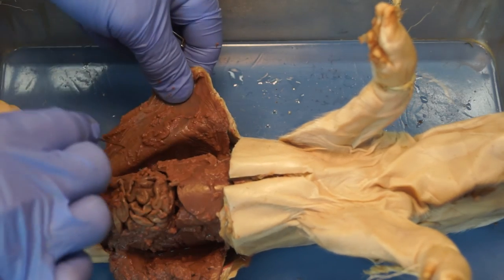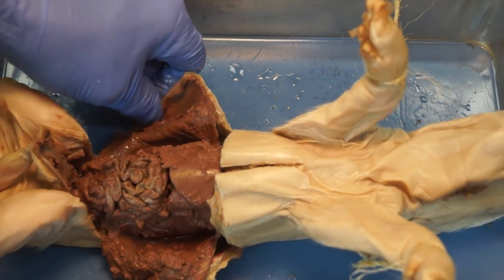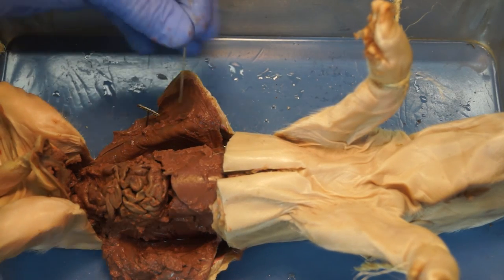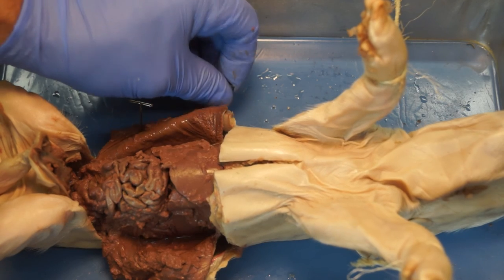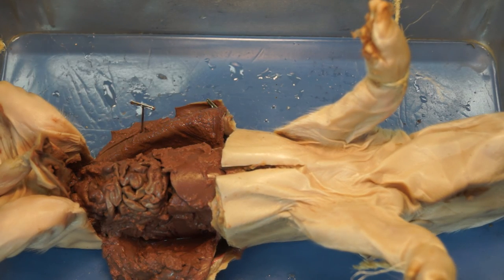That would be the first step in this process. You may also want to rinse out the inside of your pig — rinse out any materials that happen to be sitting in there. You can see there's some brown material in here. And those are the cuts to access the abdominal cavity.